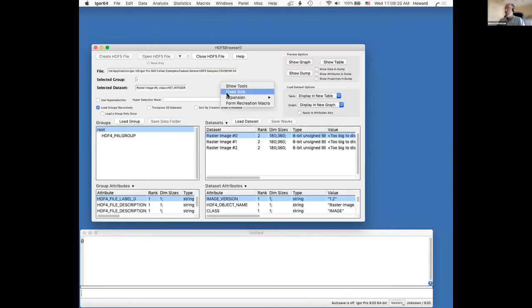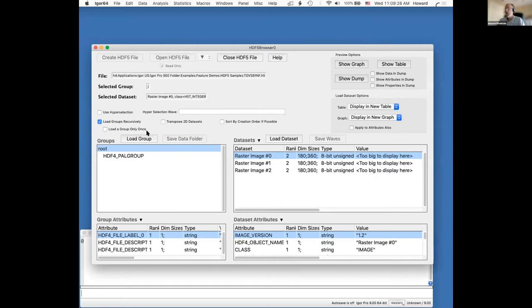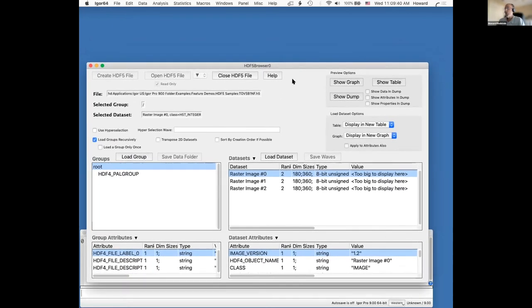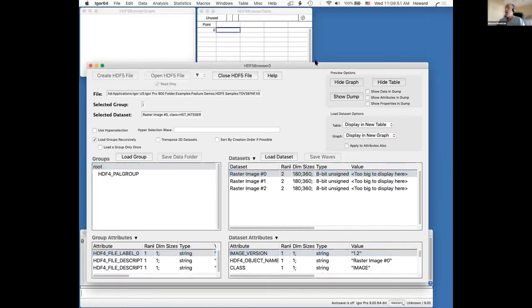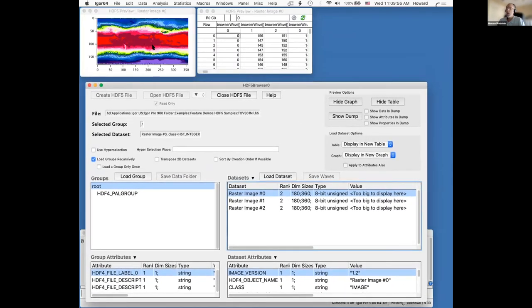I'm going to expand this so you can see it better. Here we have a list of groups, here we have attributes for the currently selected group, here we have a list of datasets, and here we have a list of attributes for the currently selected dataset. We can preview the selected dataset or group. I'm going to click show graph and show table, and now when I click a dataset I get a preview of the dataset in the graph and a preview in the table.